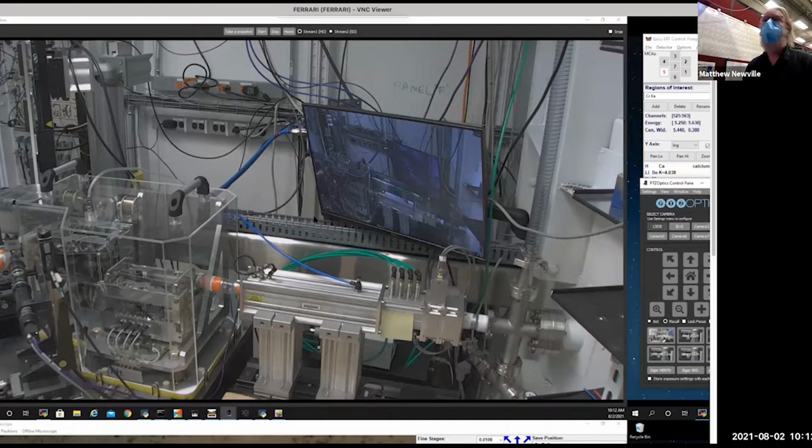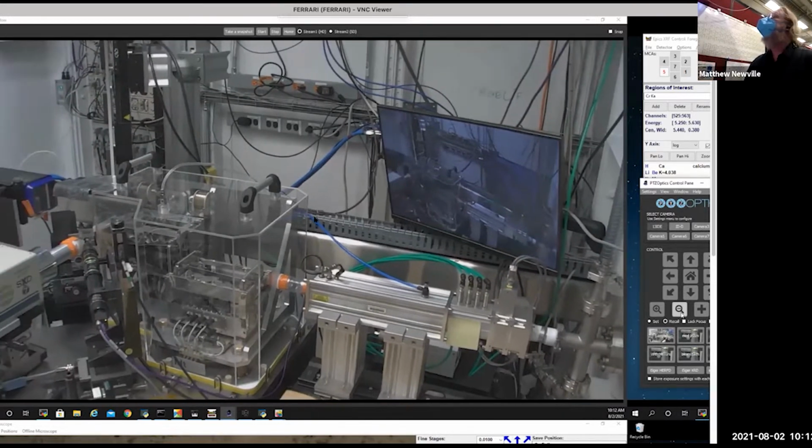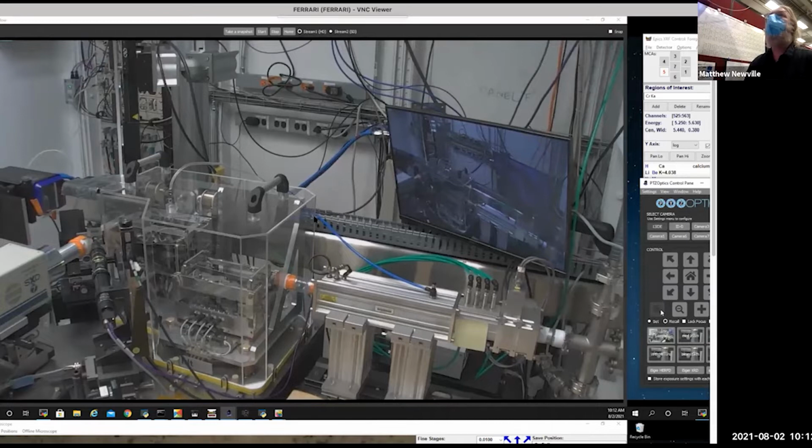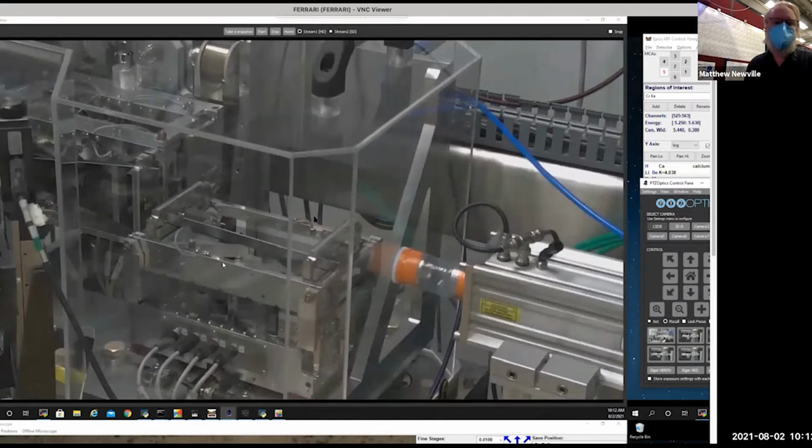Then, after that, we have here in this clear box, mirrors that both deflect and focus the beam. So these mirrors, I can zoom in on that a little bit, are flat pieces of silicon that are pitched at about 3 milliradians. So that will deflect the beam. A mirror is a low pass filter, so that does some harmonic rejection as well.